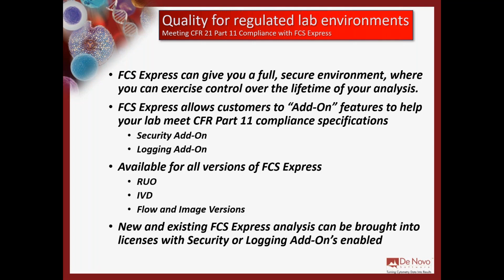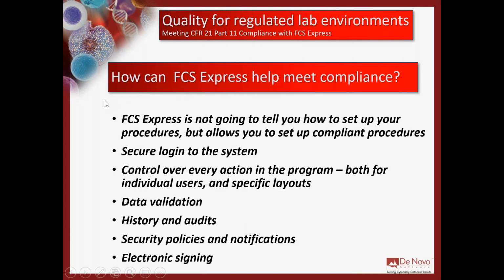We do see many customers who work in a standard RUO, non-validated package, and then they bring that over to FCS Express with these add-ons enabled when they're ready to go through that analysis a little further. So how does FCS Express help meet compliance for you?